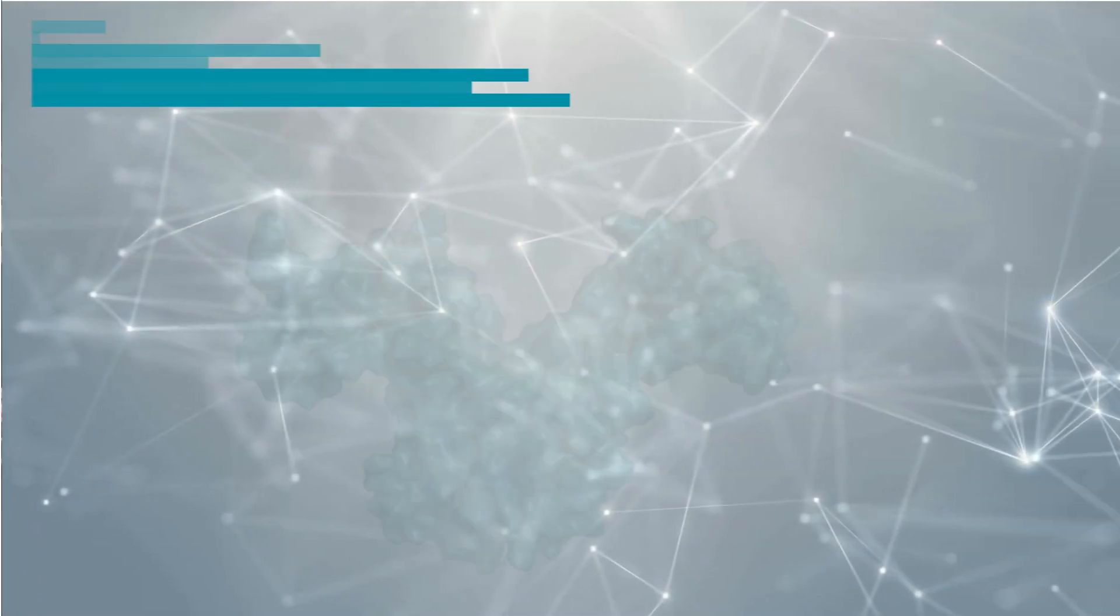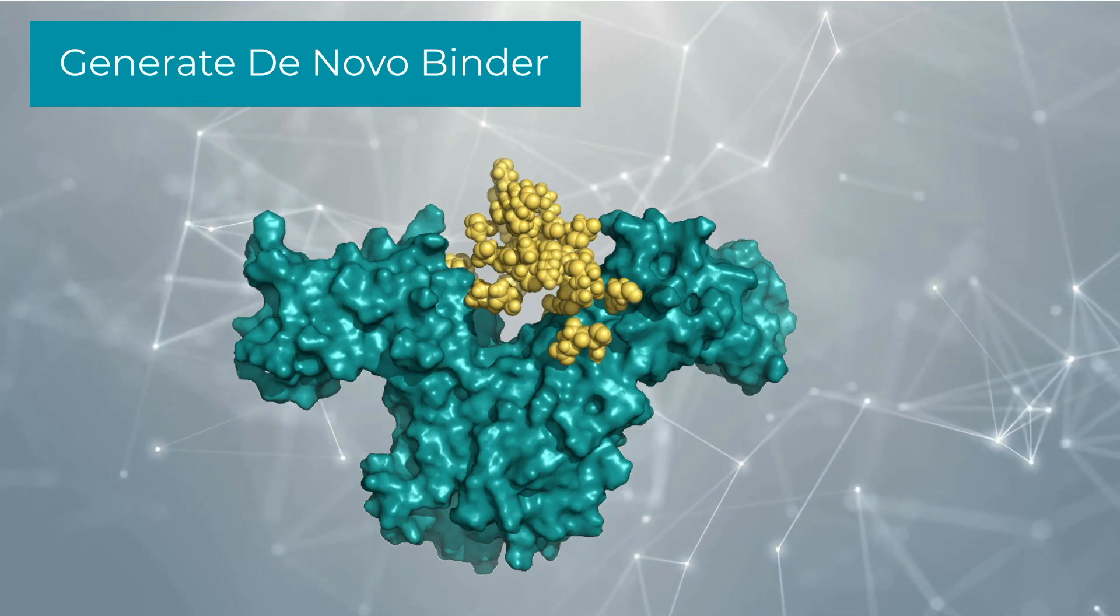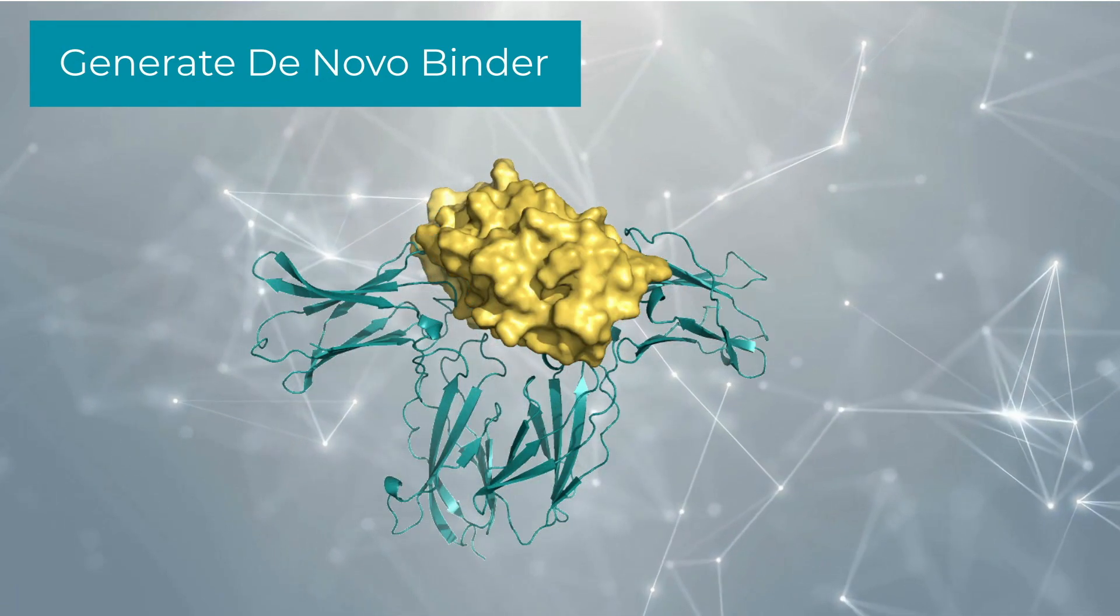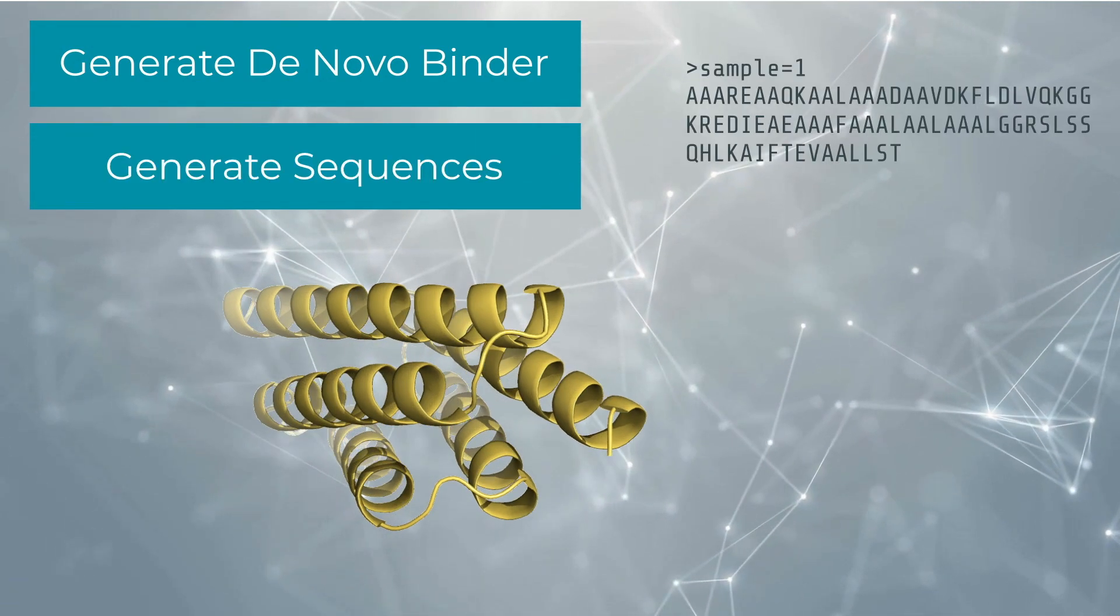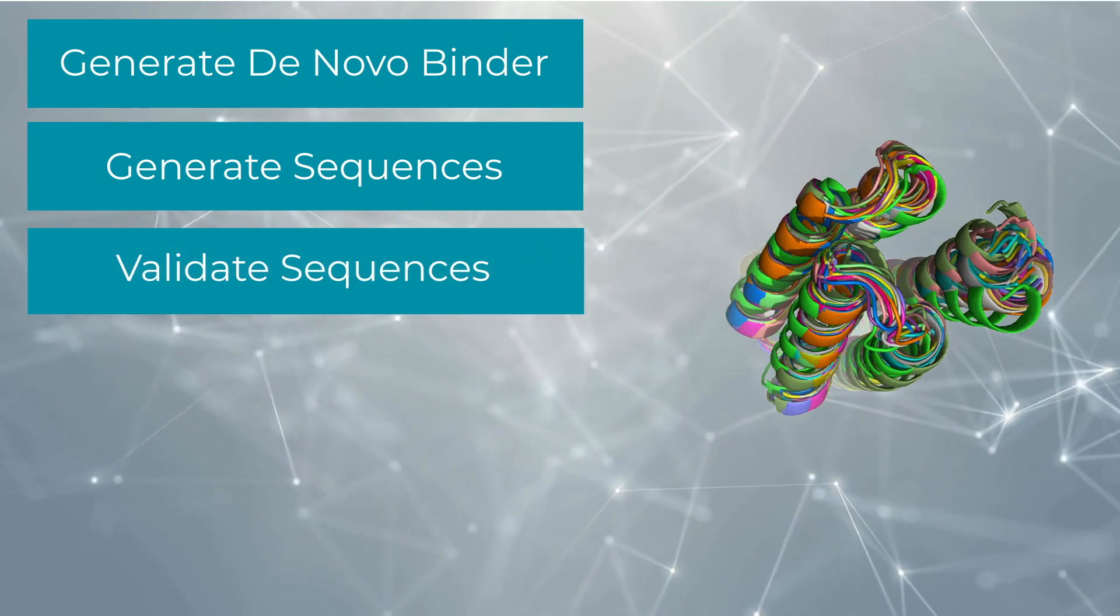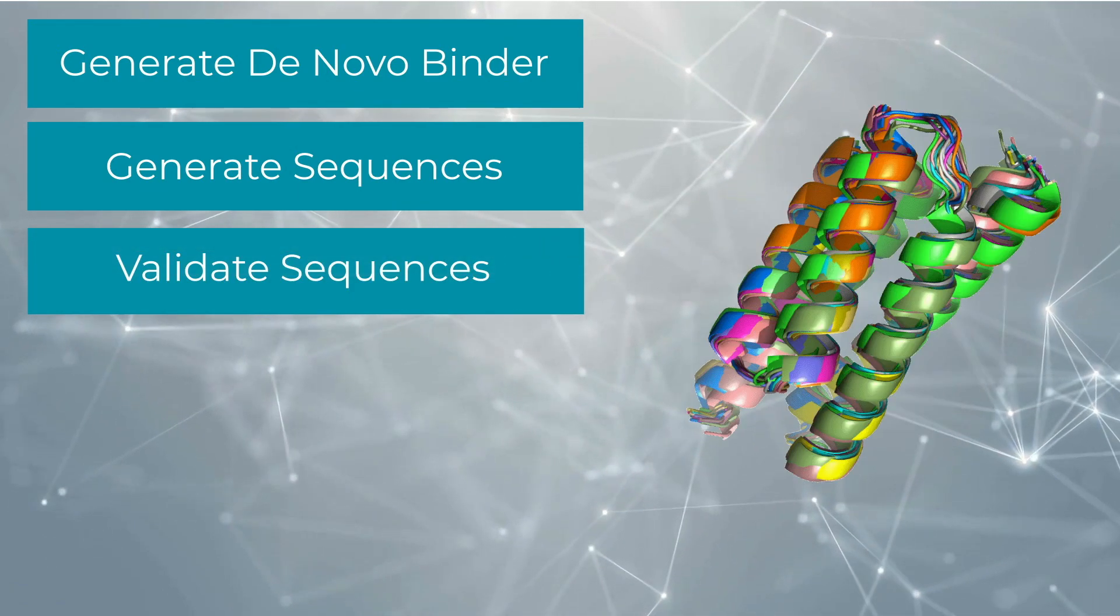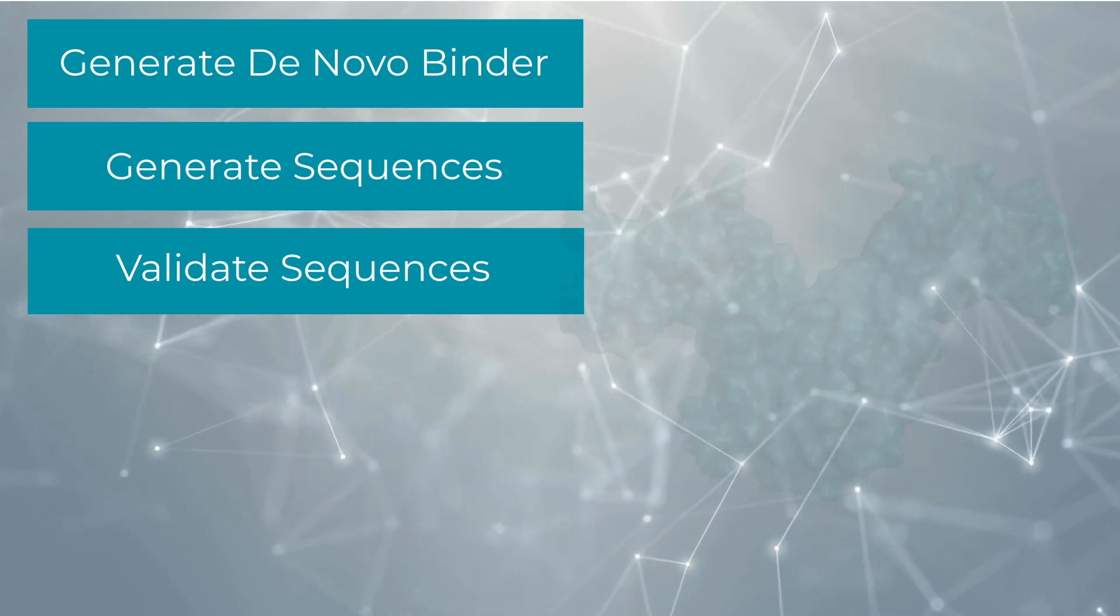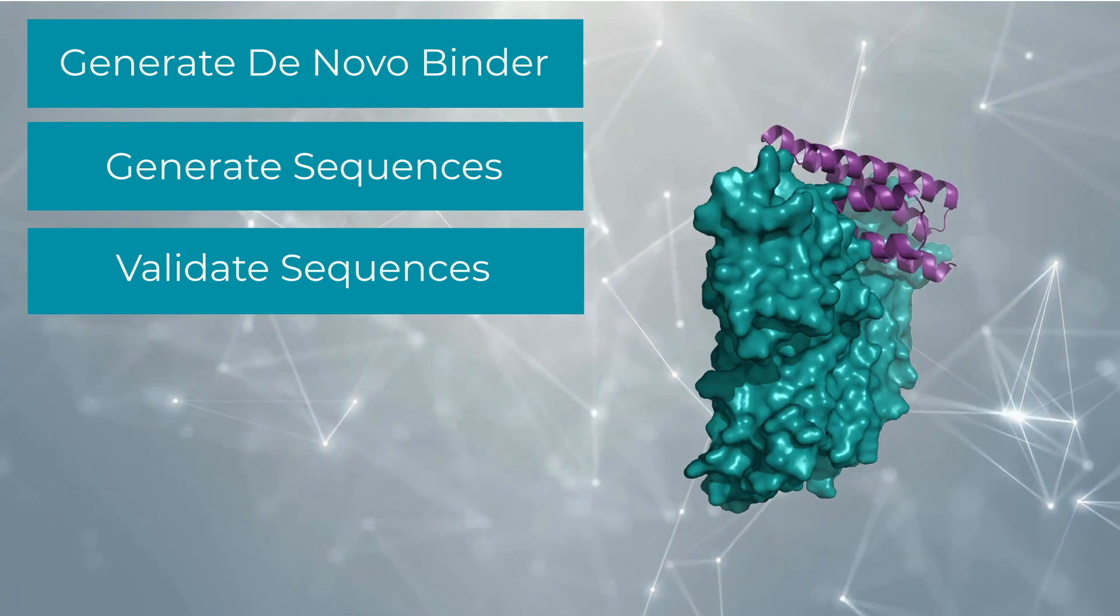Generate novel protein binders for your target with RF diffusion. Design sequence libraries for novel binders with protein MPNN. Generate structures for your new library with AF2 single-seq for monomers and threading for the bound mode.